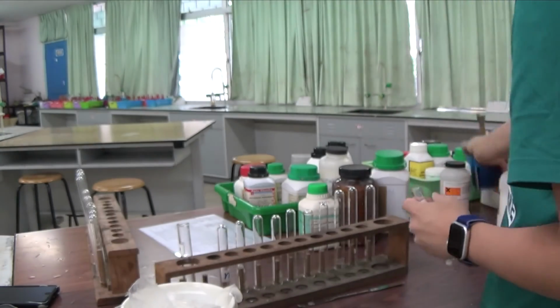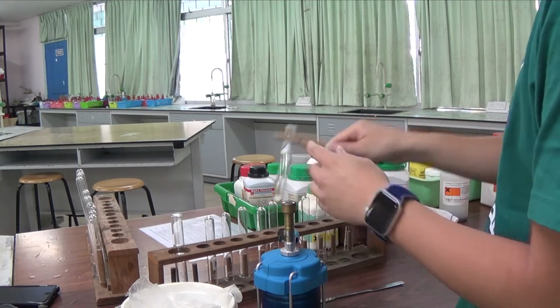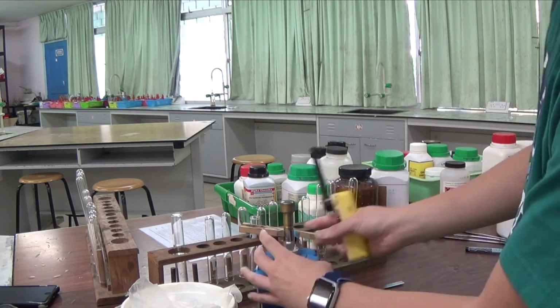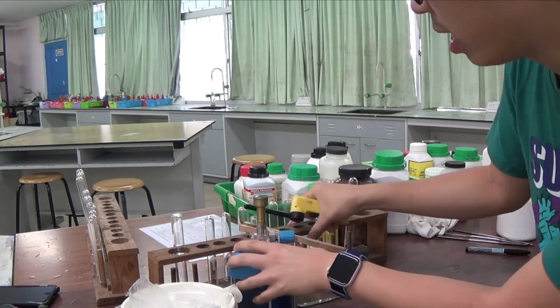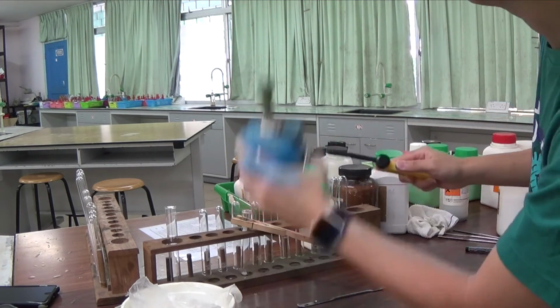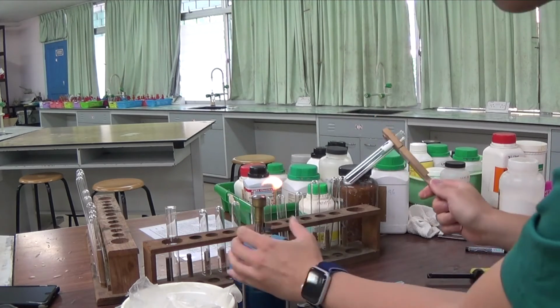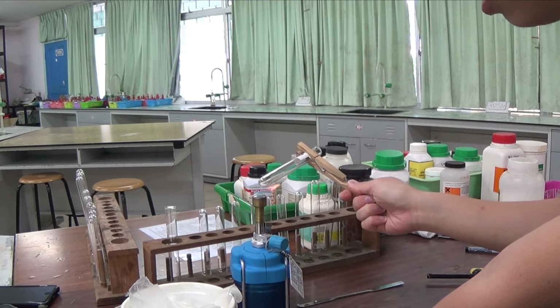Okay. So I have a Bunsen burner here. Test tube holder. Make sure your test tube holder is tight, because I think I broke one accidentally because the test tube holder was not tight enough. Yeah. So make sure that when you start the Bunsen burner, the air hole is closed, because you don't want to not be able to see the flame at all. Okay. There's gas. I just want to try thermal decomposition first, but then later on we will test for the cations in a separate experiment.